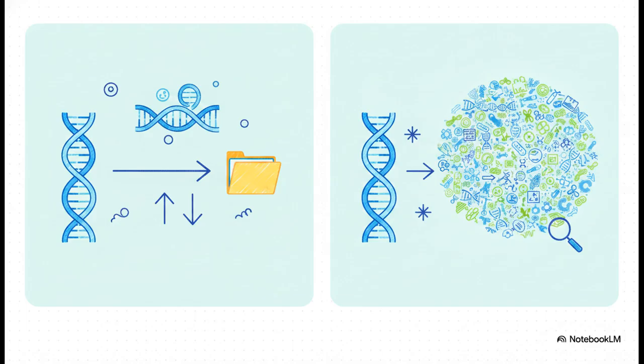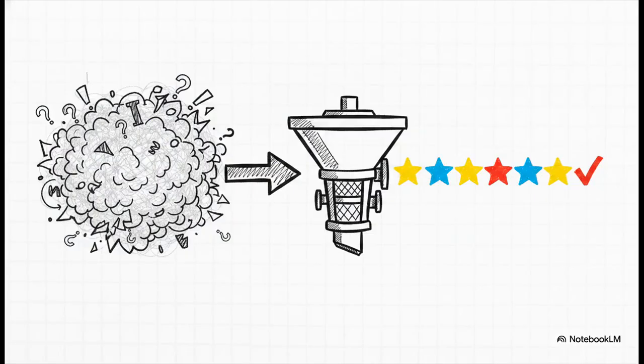Just remember, your background set has to contain all the genes present in your input set. Now, because we are testing across many different tissues simultaneously, we naturally run the risk of false positives. But TissueEnrich handles this mathematically. The raw p-values from that hypergeometric test don't just get handed straight to you. They are rigorously corrected for multiple hypothesis testing using the Benjamini and Hochberg correction. This means the final numbers you are looking at are highly dependable and mathematically controlled for false discoveries.